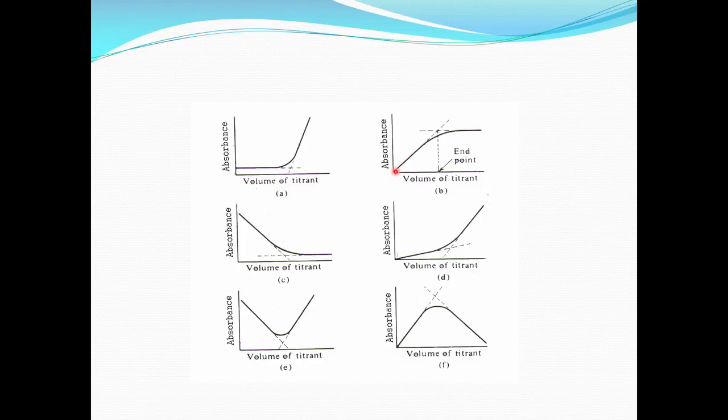So, EDTA will keep on giving increased absorbance until it reaches the equivalence point. After that, any addition of EDTA, which itself is colorless, cannot increase the absorbance. So, the reactant and reagent are colorless, but the complex is colored. So, there will be an increasing curve attaining a constant value.